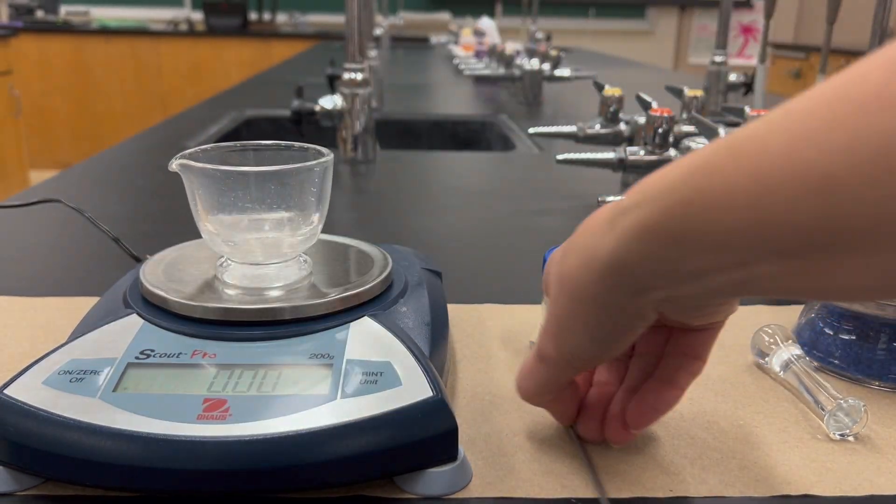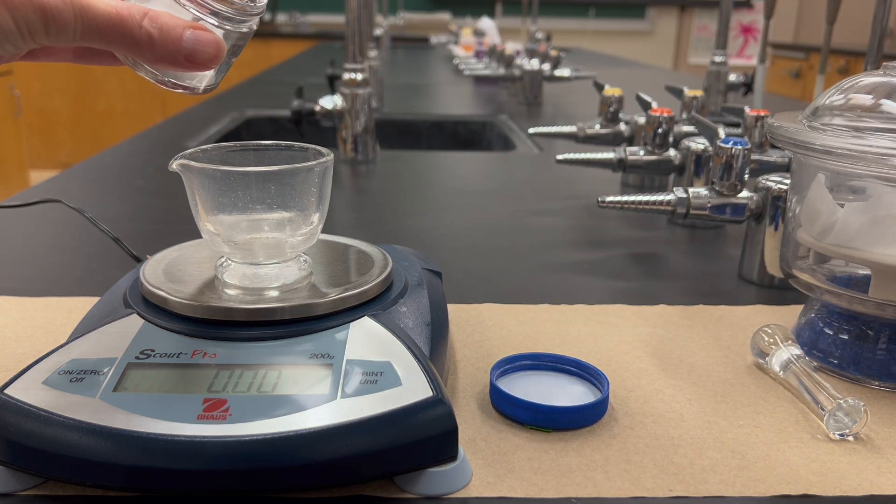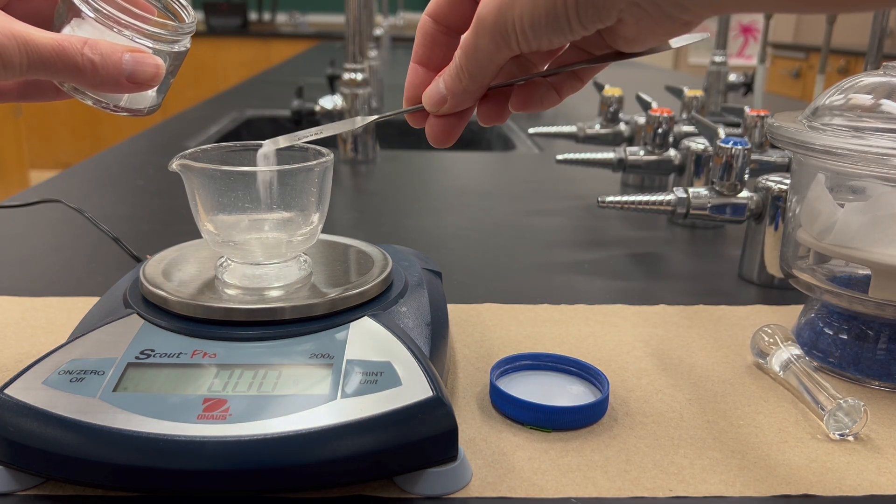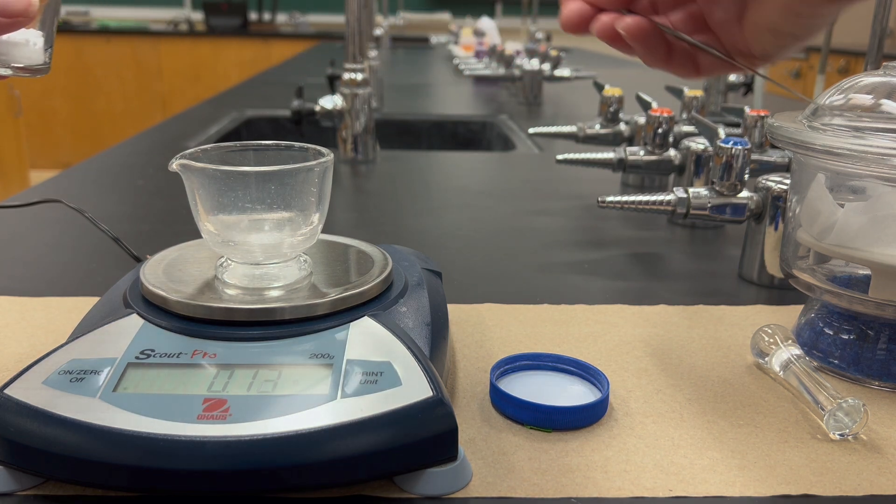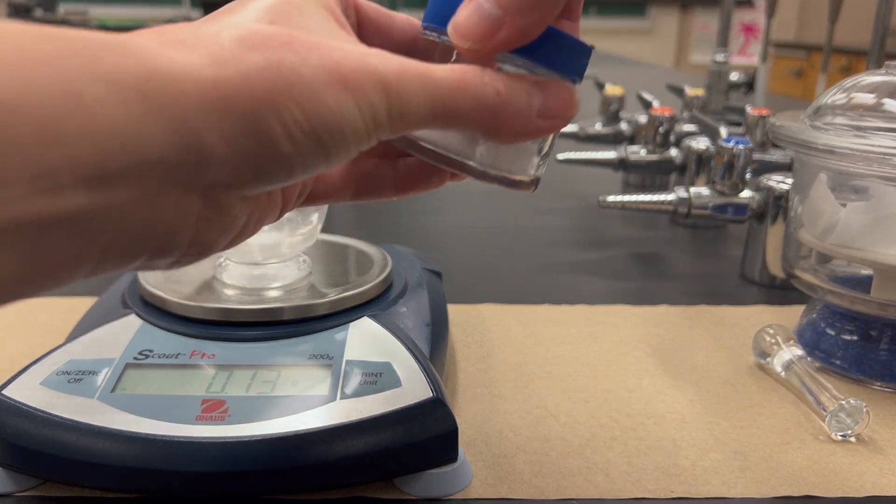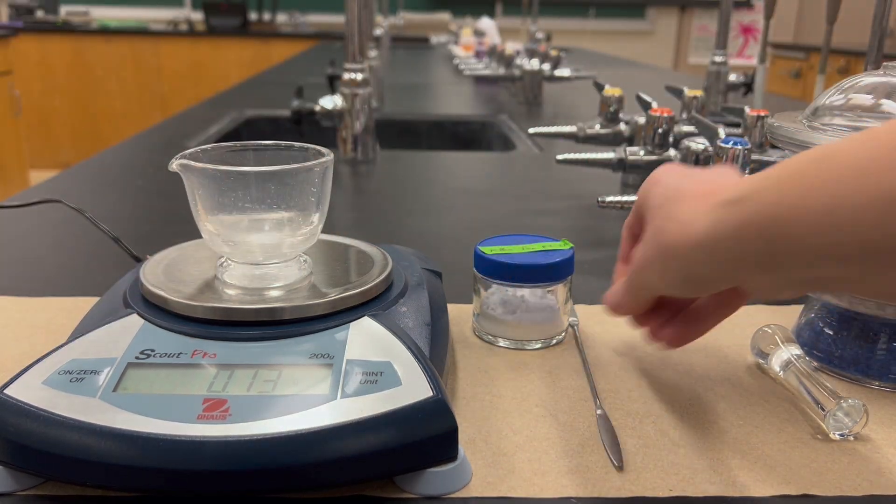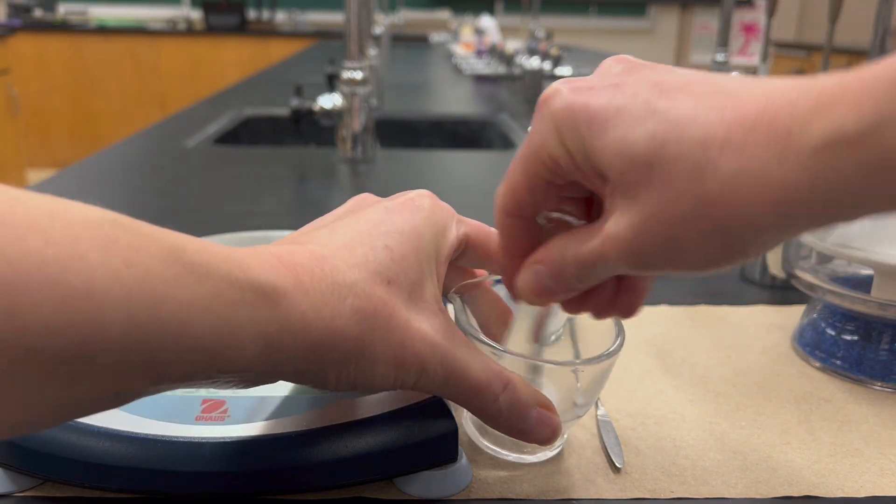This part we will measure though, so you can put that mortar onto a centigram balance and then just scoop out the KBR until it weighs somewhere between 0.1 and 0.2 grams. But again, this is not very precise, and actually if you go over, that often works kind of better, to tell the truth, so don't worry if you put too much.